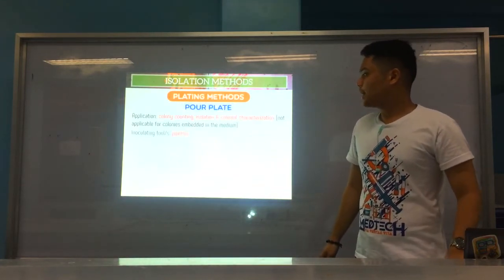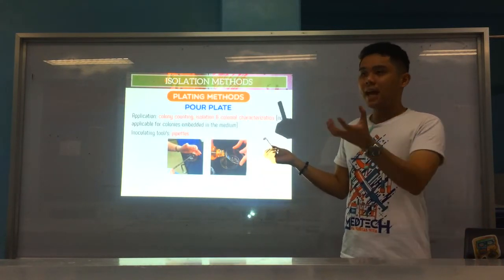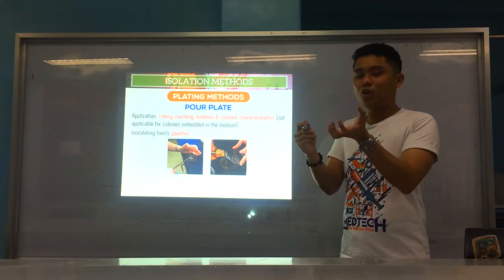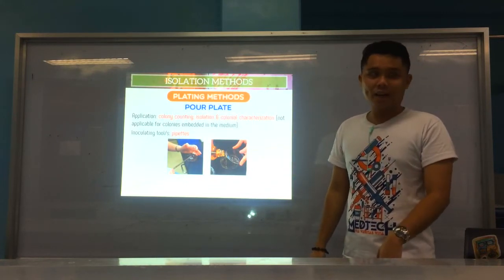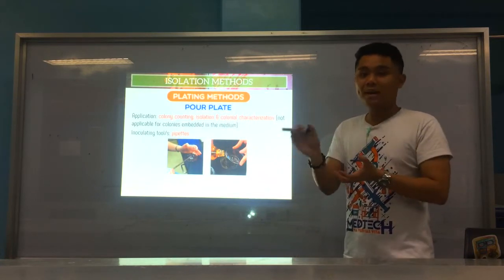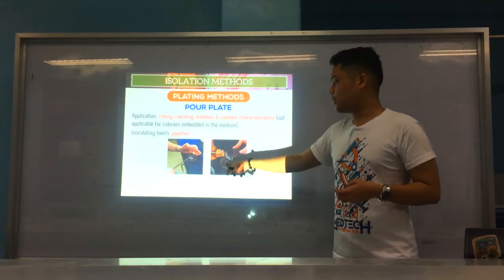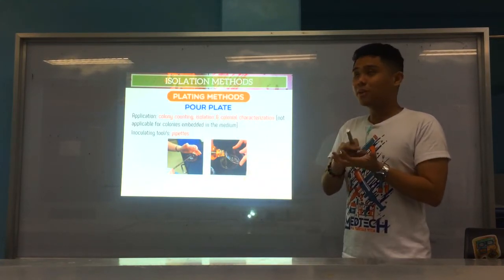Now we go for pour plating, still for isolation and colony counting. What we do is, in an empty Petri dish, we introduce what we call the inoculum using a pipette. And after the inoculum, you pour the culture media. Once the inoculum and culture media are incorporated, we mix it together by swirling. So you first put the inoculum, and then after, pour the culture media. Okay? And then you mix it by swirling. Okay?